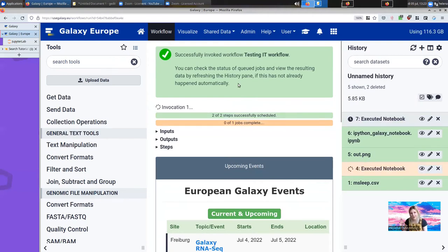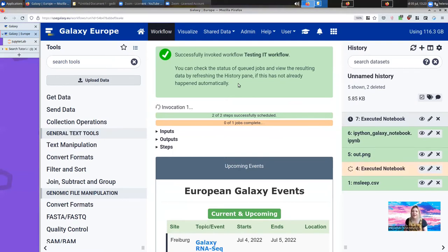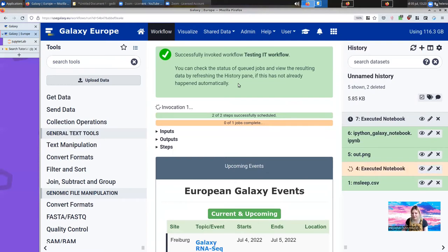Then I can go look at that notebook and look at any of the analysis that's happening in there, change any visualizations. So as a summary step for your workflow, it's a fantastic way to open up your data to new visualizations.